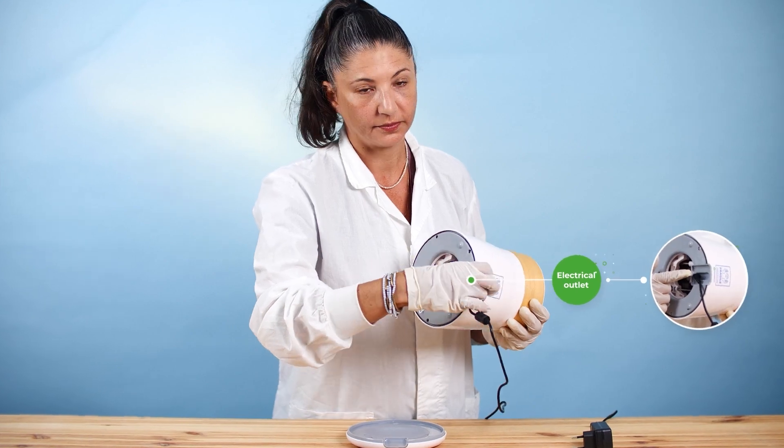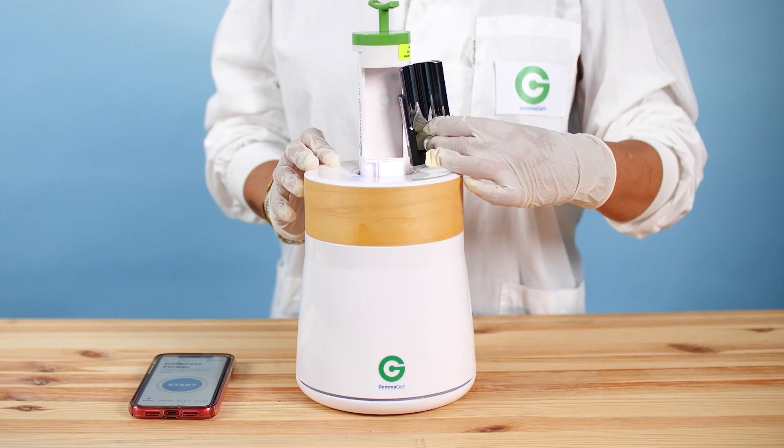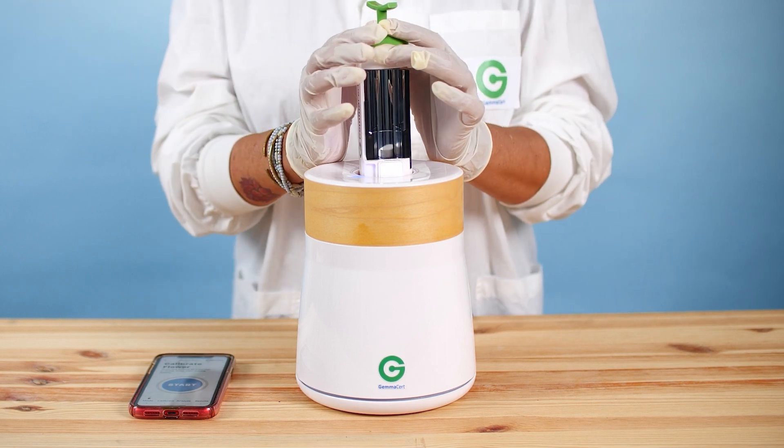Connect your GC to the power supply and pair it to your Android or iOS device. Place the reflector inside before calibration.